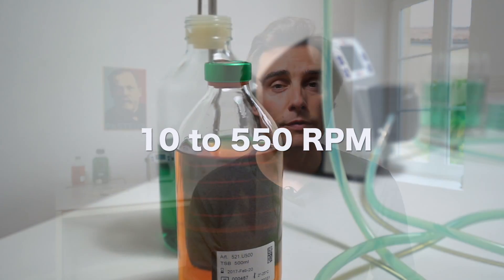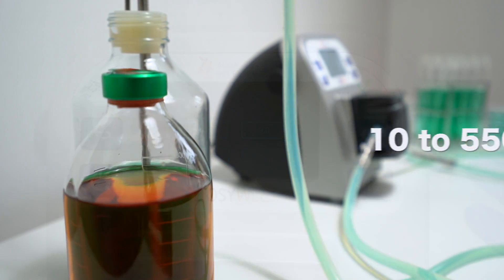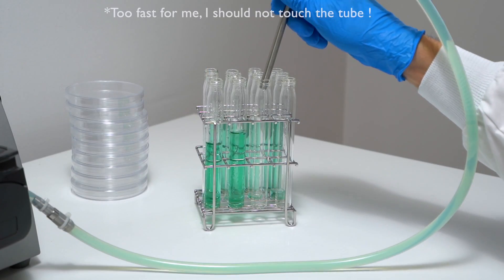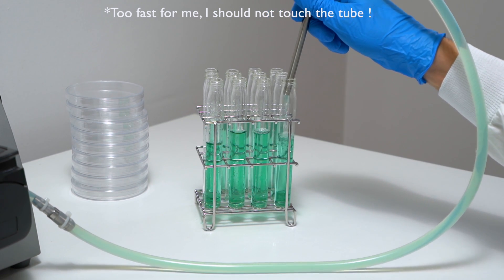About the speed, the Dozy Well is really good. You can transfer from a big bottle to a small tube and you can also change your interval. It means that if you are really fast, if you get used to it, you can go really fast and gain a lot of productivity. So really good point for the Dozy Well — it's really fast enough for me.